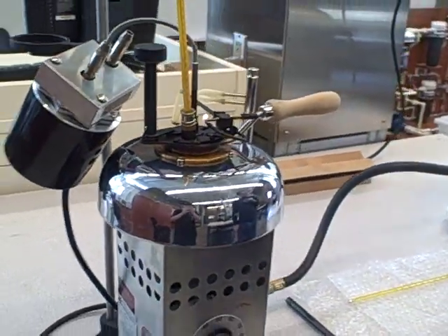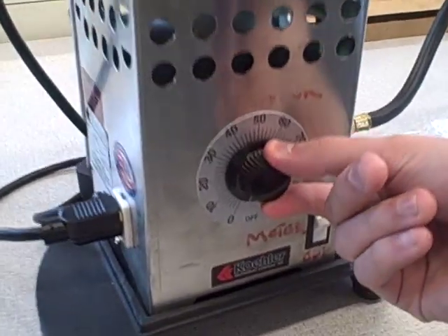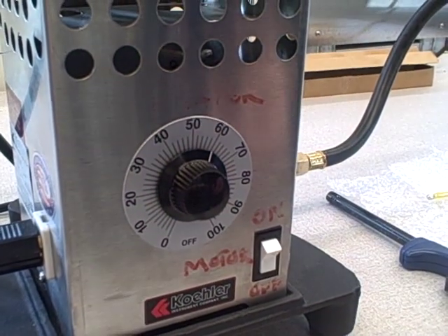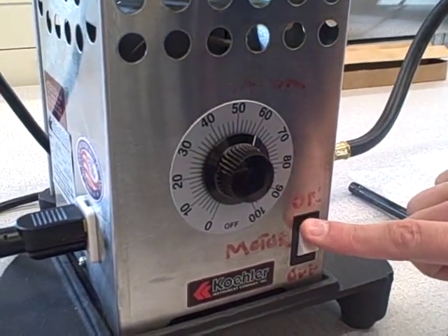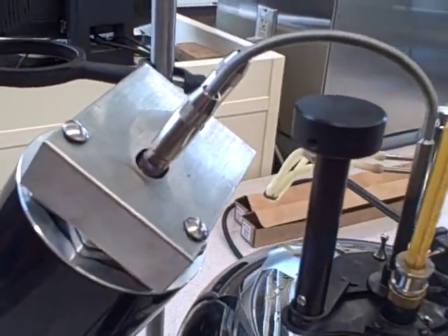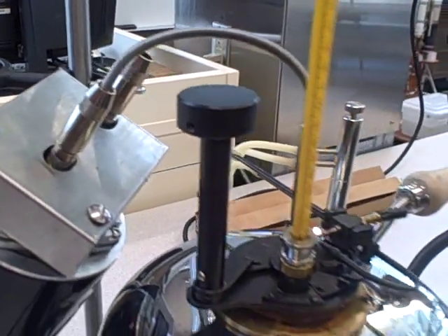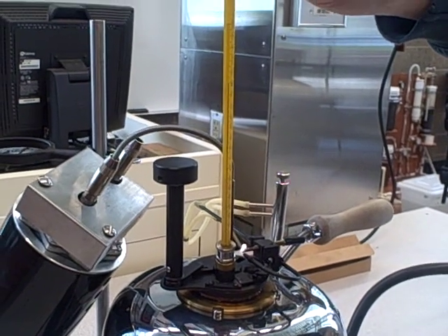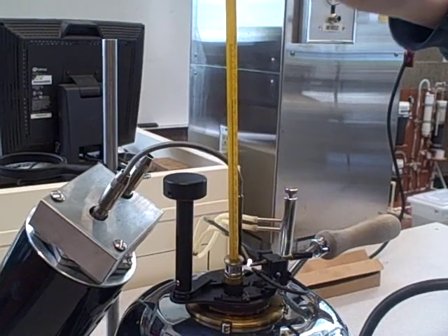And then you set the heat supply of the stove. I usually start it between 50 and 70 — I'll set it to 60 right now. And then you start the stirring device to help stir the lamp oil and help heat it up. Then you just want to keep watching the thermometer. Right now it's already been preheated — it's about 182 degrees.